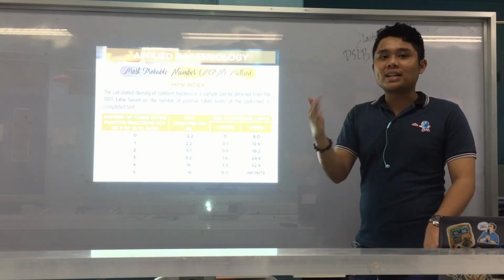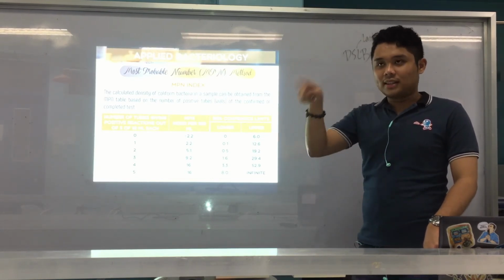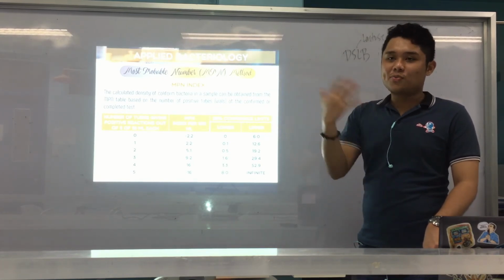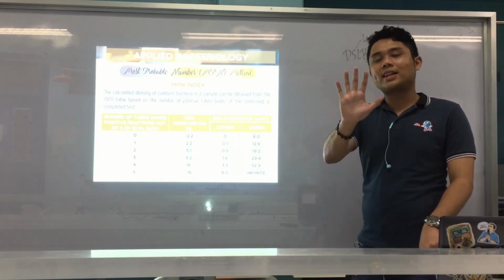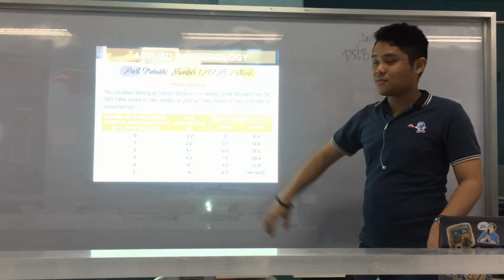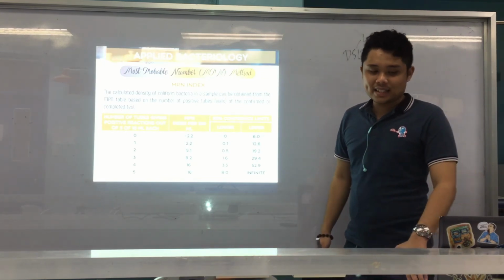each. But for other setups, like our 3 tubes of 10 ml, right? Those 3 tubes, and three setups, right? Or 5 tubes, three setups. They have their own MPN table. Alright? So this one is for the 5 test tubes with 10 ml each. That is what we performed. This is the table to follow. Alright? But again, for other setups there are different MPN indices.